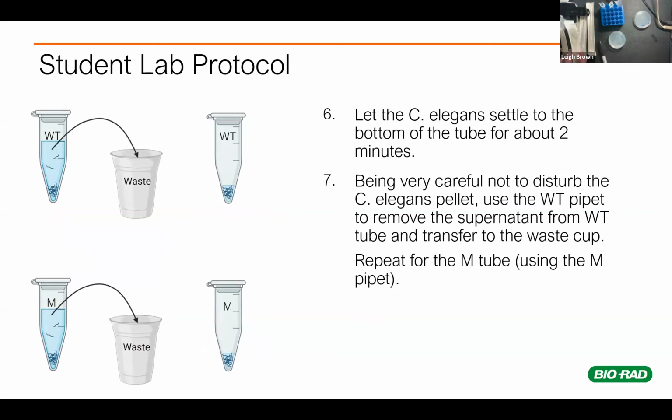And of course, sometimes you have kids where you don't want to give them the racks because they've got those type of hands. And so this is a way to keep them busy for at least 2 minutes of that class period. If you've got those worms and you're holding them, another thing you can do is start looking at them and you can watch them pellet.